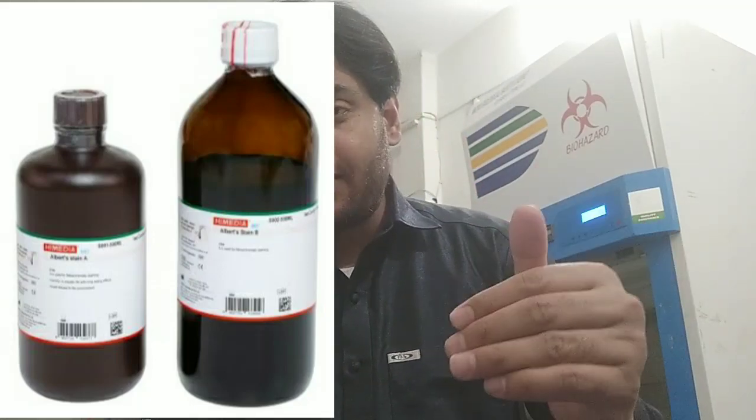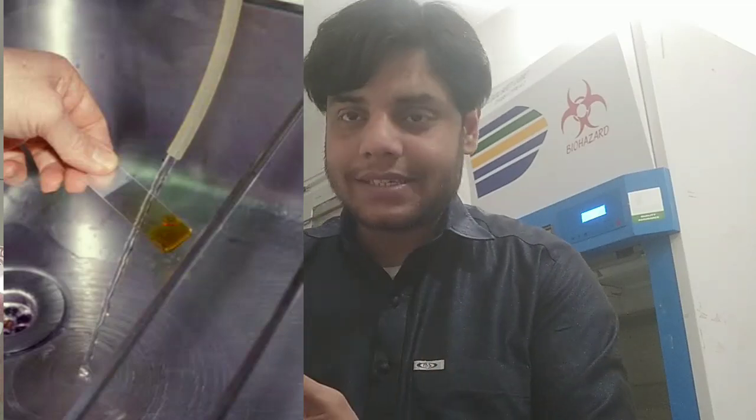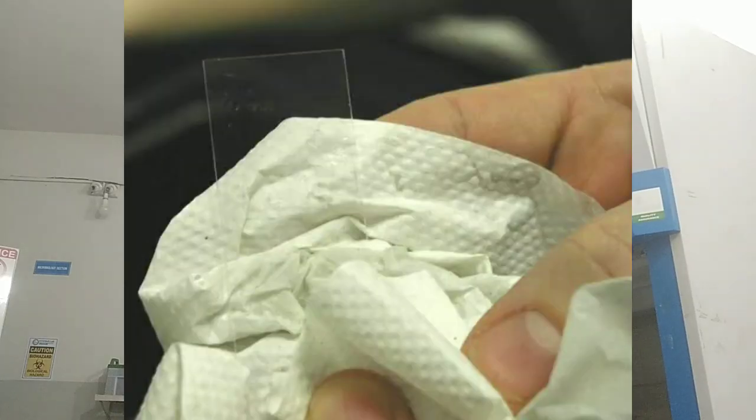After that, you will add Albert solution B and wait for 2 minutes. After that, you will wash it. In the first step you will not wash it, and after the second staining you will wash it with slowly running tap water. Once you wash it, you will dry it with the filter paper. You will just wrap this slide with the filter paper and wait.